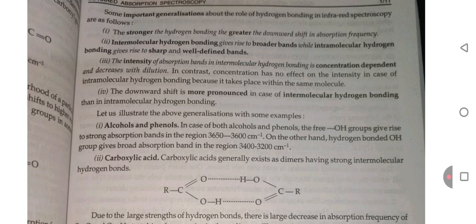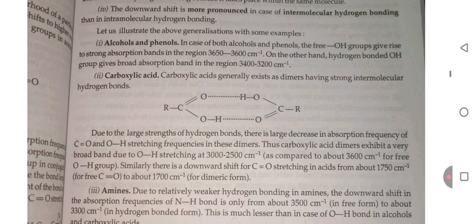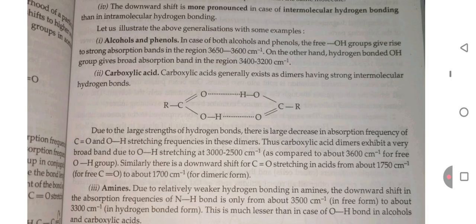Let's illustrate the above generalizations with some examples. Alcohol and phenol. In the case of both alcohol and phenol, the free OH group gives rise to a strong absorption band in the region 3650 to 3600 centimeter inverse. On the other hand, the hydrogen bonded OH group gives a broad absorption band in the region 3400 to 3200 centimeter inverse.